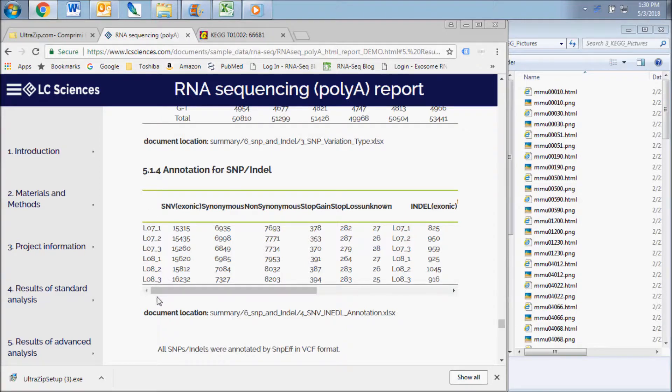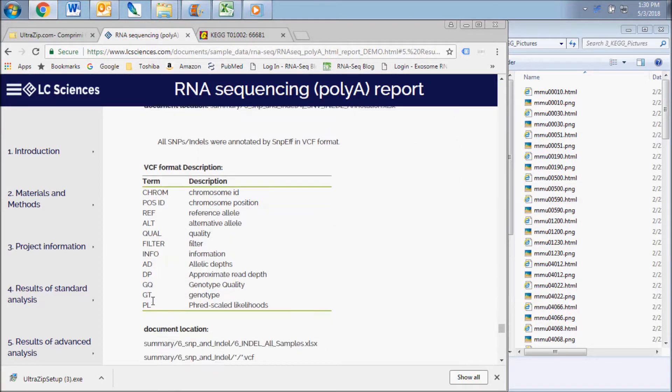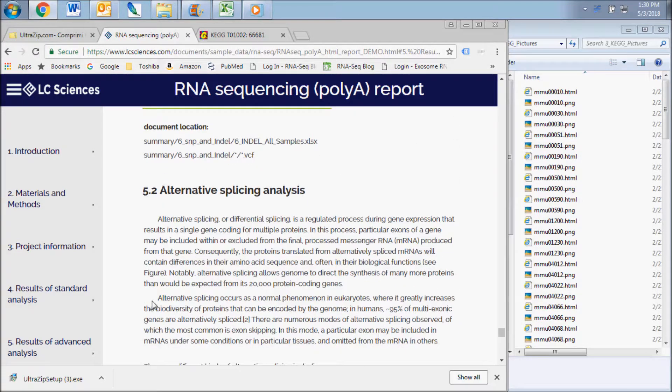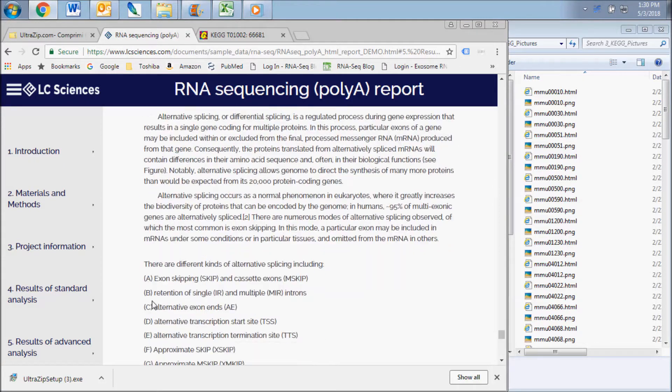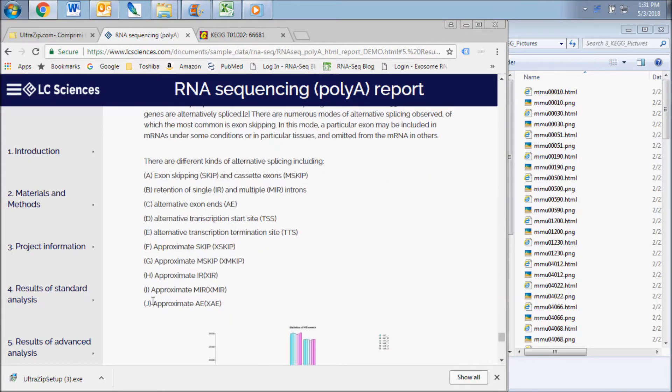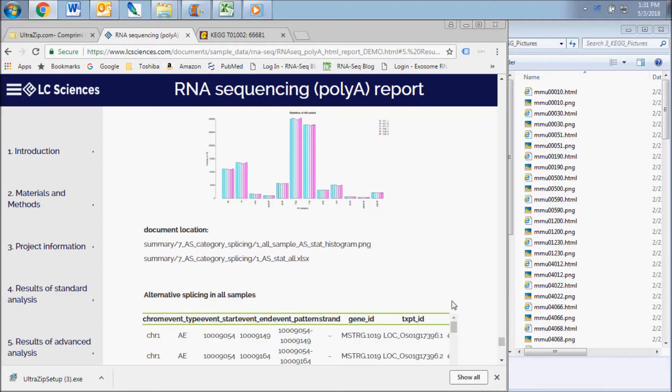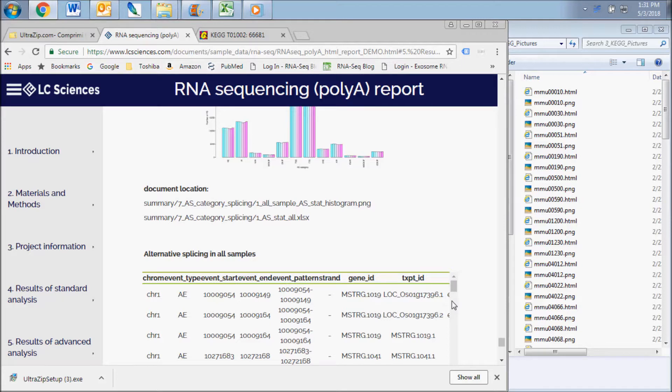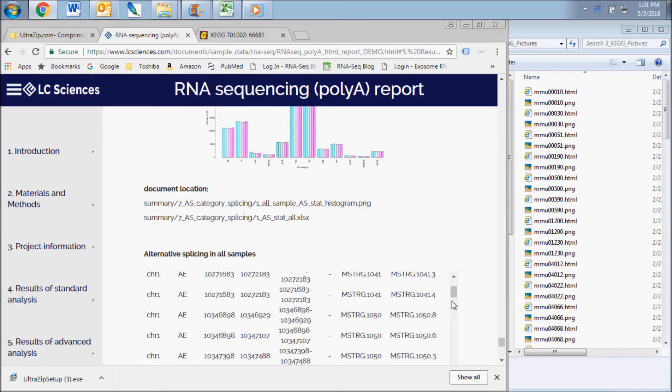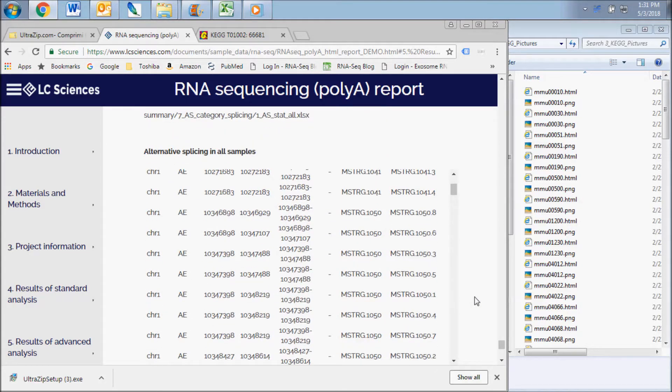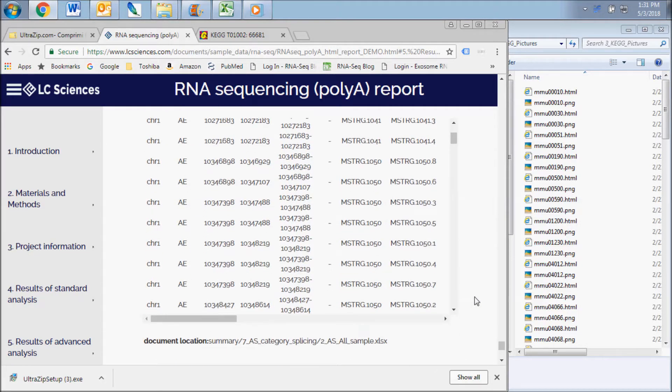The alternative splicing analysis results subsection displays data contained in the AS category splicing data folder. The first chart displays the statistics for the different types of alternative splicing events and the chart lists and describes each of the alternative splicing events sequenced in your samples.